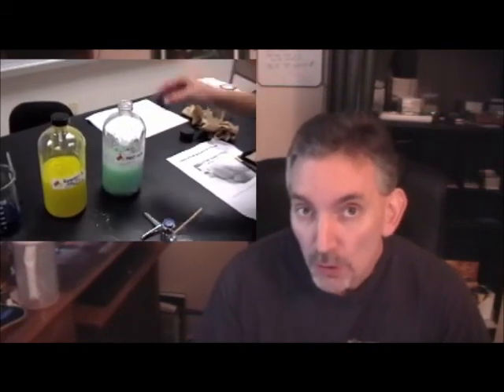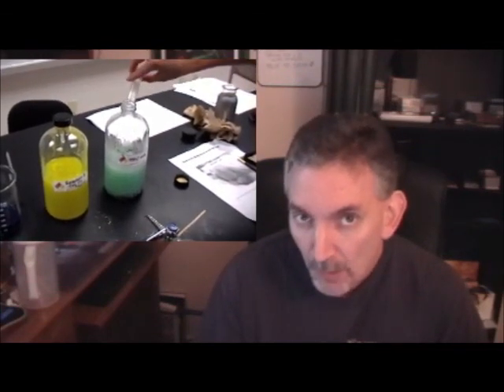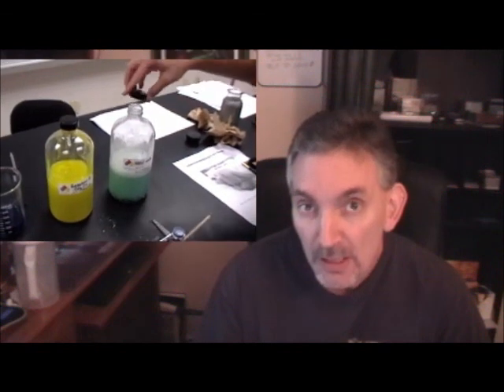For your chemical waste for today, we've got two primary bottles. There's a waste bottle for any chemical reaction that doesn't involve chromium. And then we have a waste bottle for any reaction that does involve chromium. Chromium is a cancer agent and we must keep that separate from the other waste. The majority of reactions with chromium will either be yellow or orange in colour for their precipitate. If in doubt, ask your instructor which bottle to put your waste into.